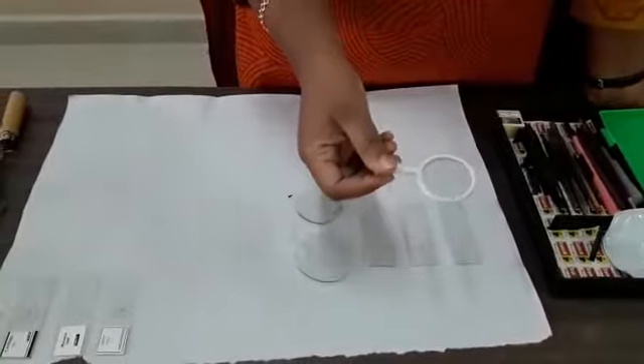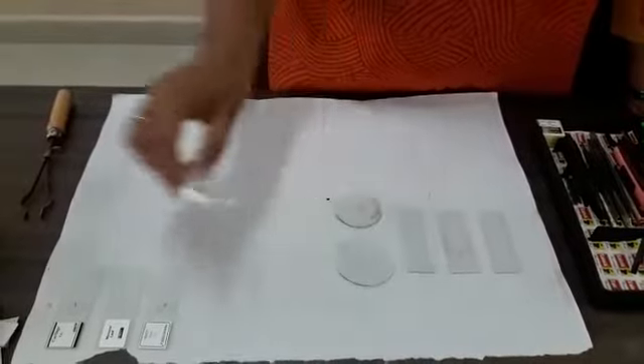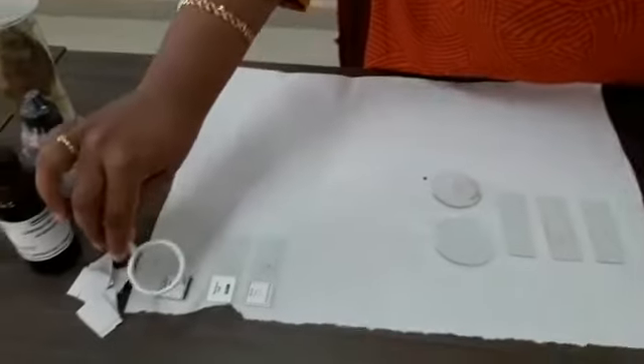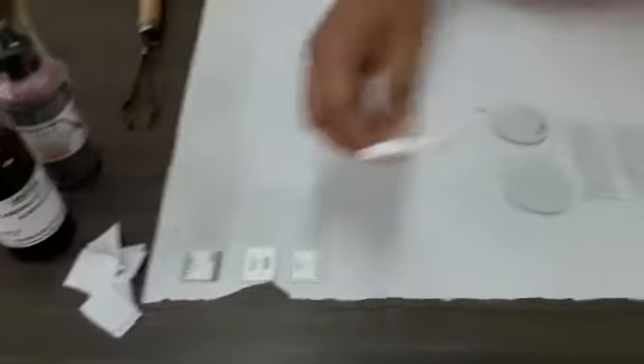In the dissection box you also have a magnifying glass. If there is anything microscopic or anything which cannot be seen with the naked eye, you can make use of this magnifying glass. You can see that it is getting magnified. So there is a magnifying lens in this dissection box.